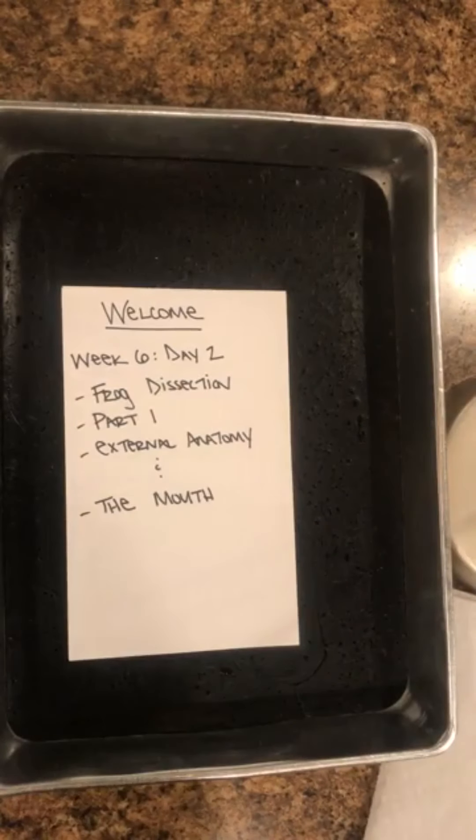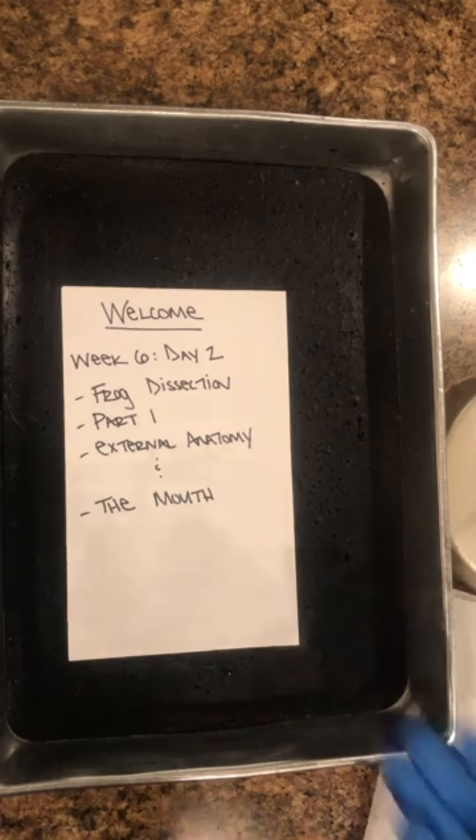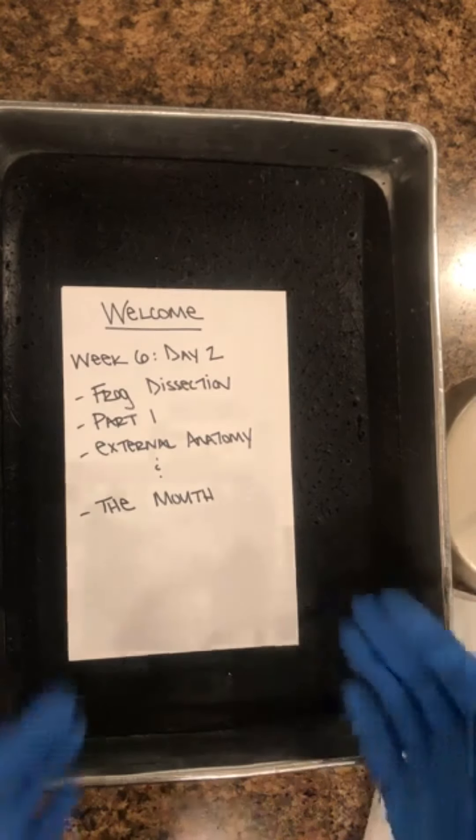Welcome to week six day two. We're going to be focusing on the frog dissection today — the first part — looking at the external anatomy and pretty much the mouth. We'll put some paper towels down because our frog is dark in color and it's kind of hard to see it against this dark background. Here is our lovely specimen of the American bullfrog.